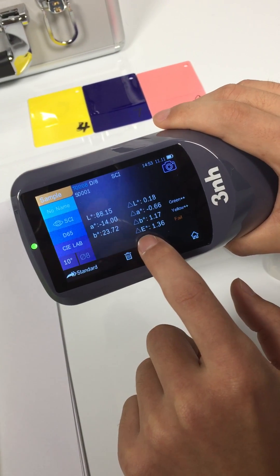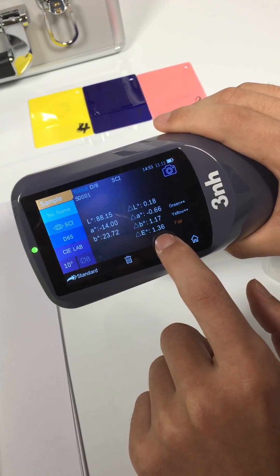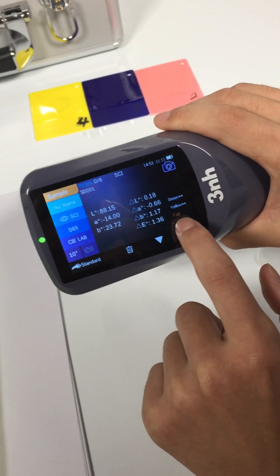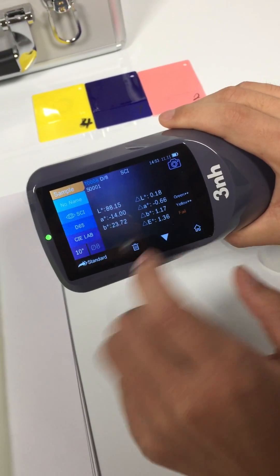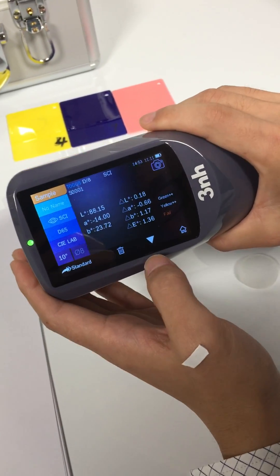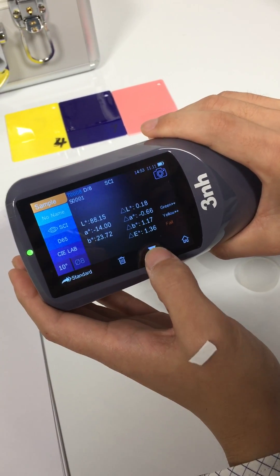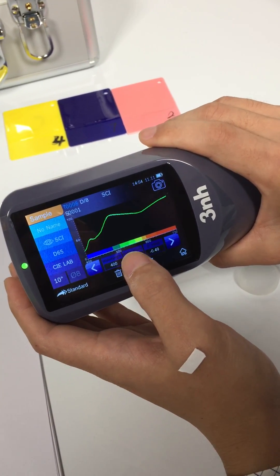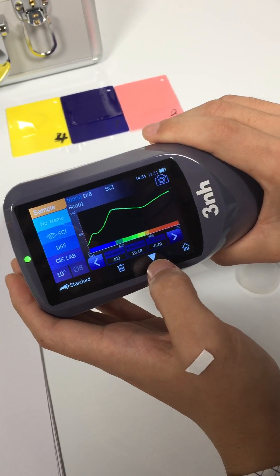The delta E is higher than one point, so it shows fail here. Here you can check the color reflectance curve.